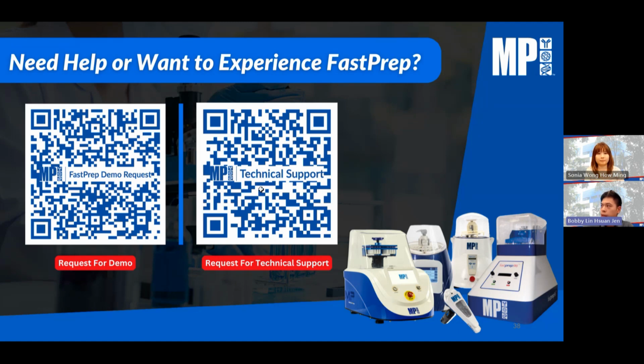So anything we can add on to, Dr. Sonia? No further comment, because I agree with using lysing matrix E as well, because it can handle a wide range of environmental samples like soil or feces or wastewater. Wastewater actually somewhat meets your criteria, because it could be very oily or dense, or with different kinds of foreign particles. So I will also suggest lysing matrix E. Okay, all right. Thanks for the question, Gazel. That is a very good question. Let's move on to the next one.